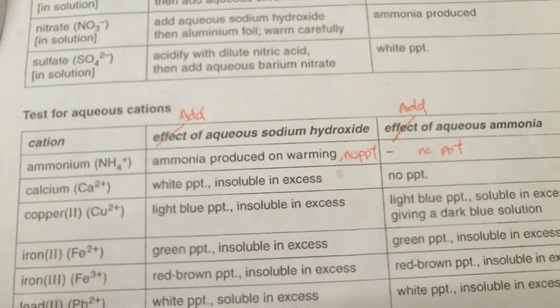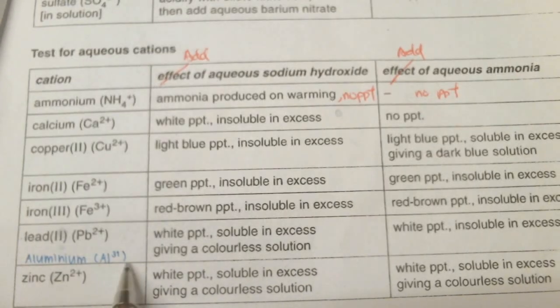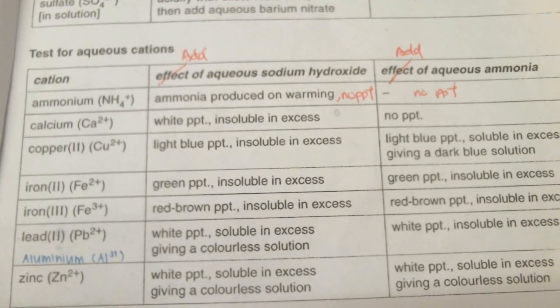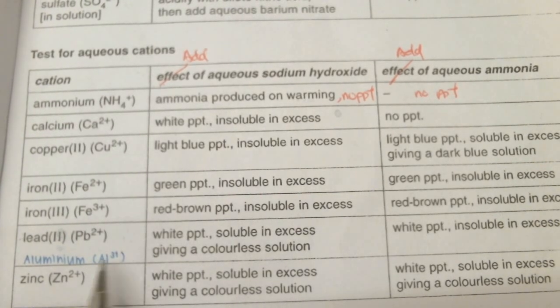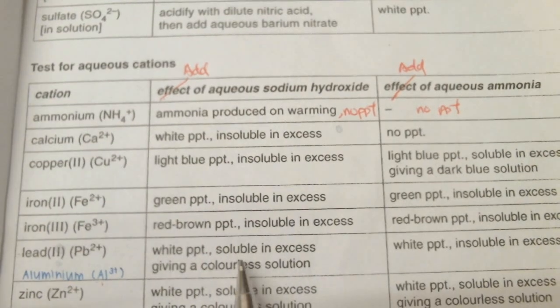But for this paper, can you please add in another ion over here, which is aluminium. Aluminium ion was tested in the 2004 to 2008 syllabus. Both aluminium and lead give off the same observation.